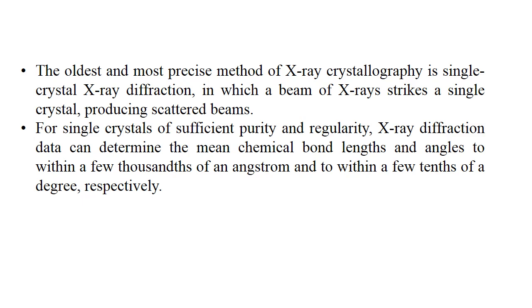When the X-rays, after scattering with the crystal, hit the detector, different diffraction pattern spots are obtained, which are used to study the bond lengths and bond angles of the structure.